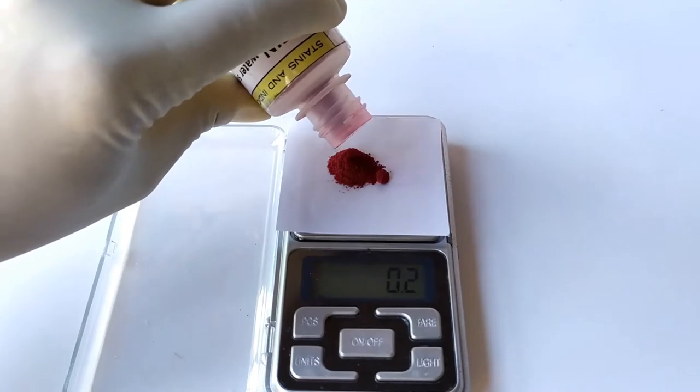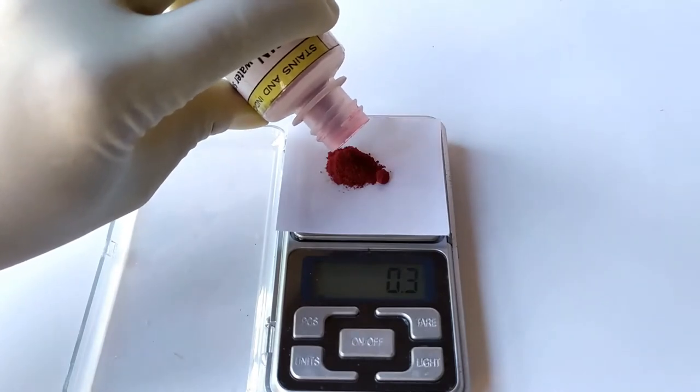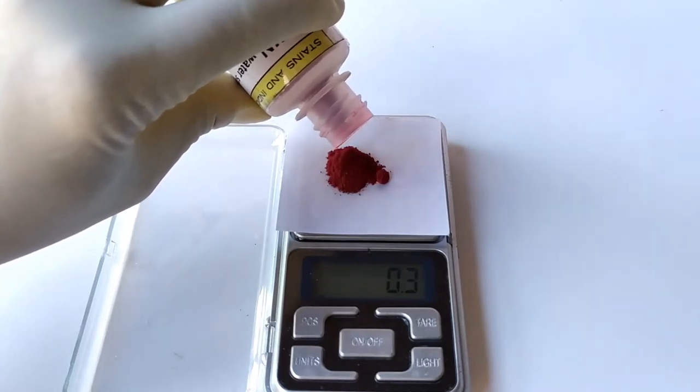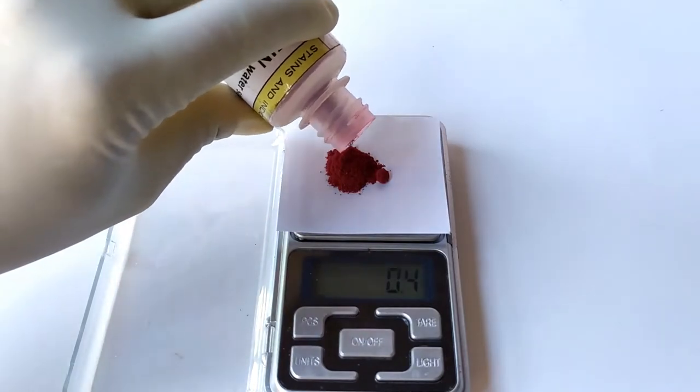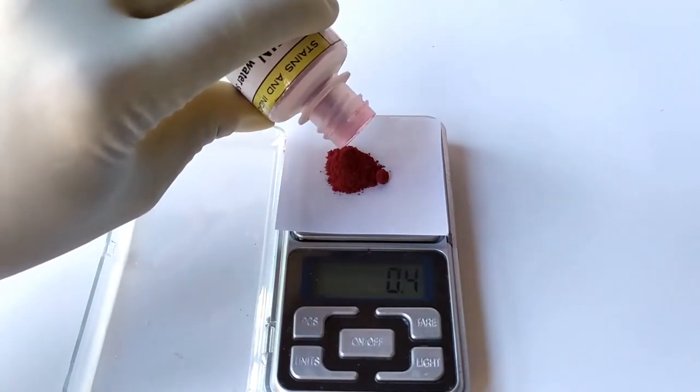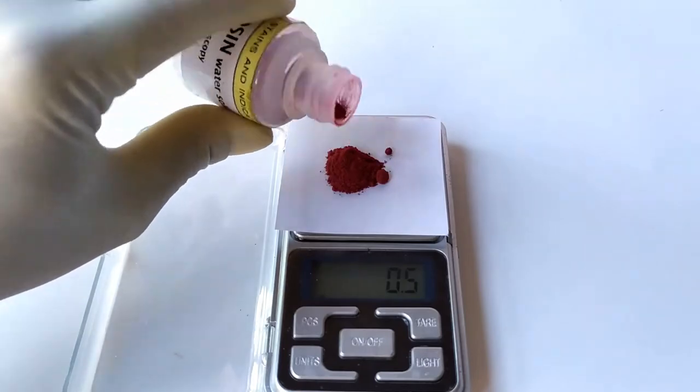I've been using a cheap pocket digital weighing scale so far for all my experiments. I lately felt the need for a much more sensitive but affordable balance that could measure in milligrams, but it has to be digital in order to save weighing time.